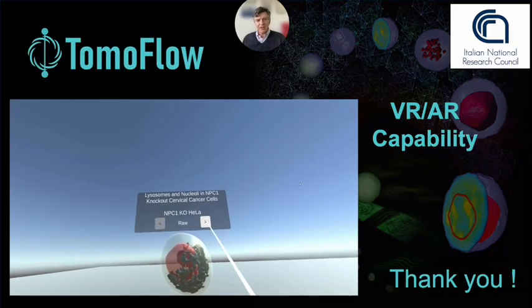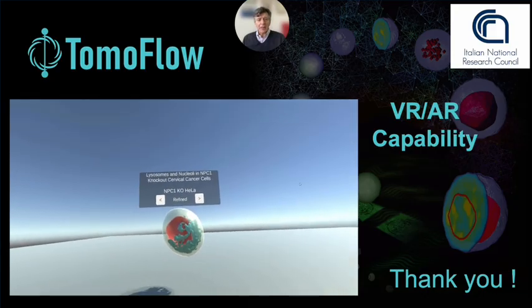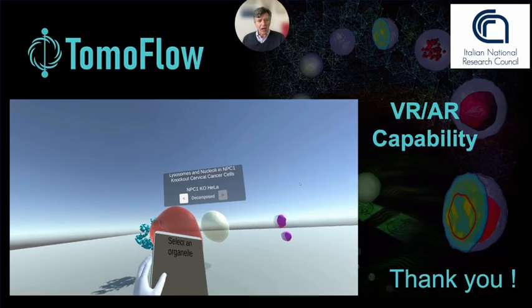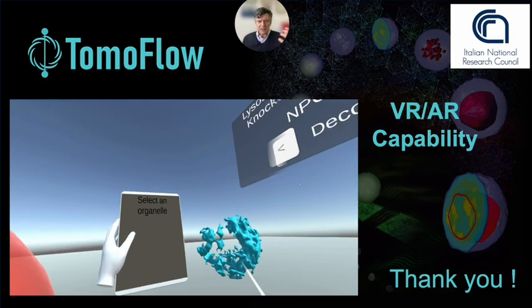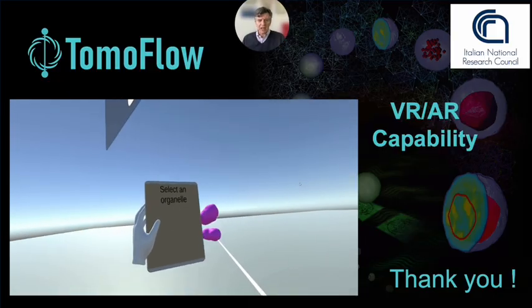As a final point, we also developed a virtual reality capability suite for the platform that allows us to analyze in a quantitative way, in a realistic 3D environment, all the information related to these data.